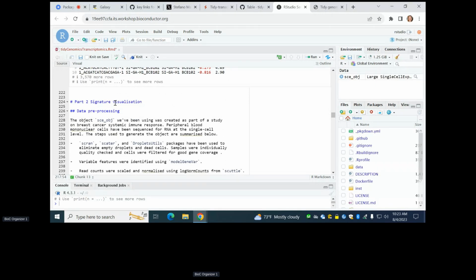Could we use character replace the variable in the select? Yes, whatever tidySelect accepts, which is a lot. In this, the new dplyr likes any_of, and you can use character. It complains if you just use character, but yeah, the answer is yes. Yeah, whatever dplyr accepts.